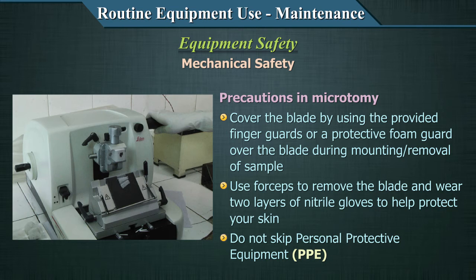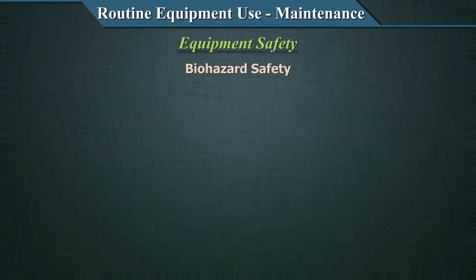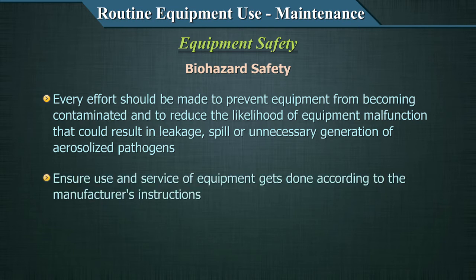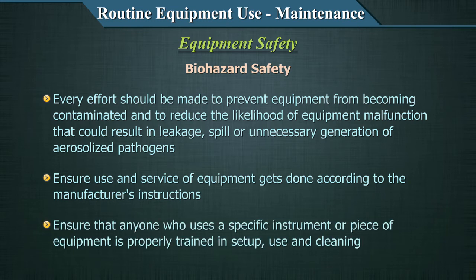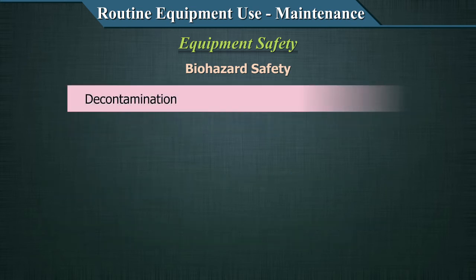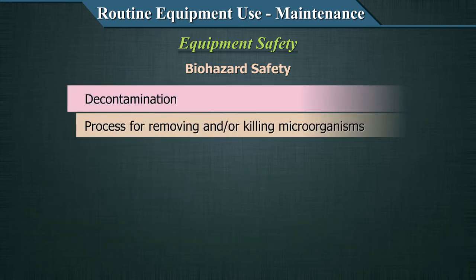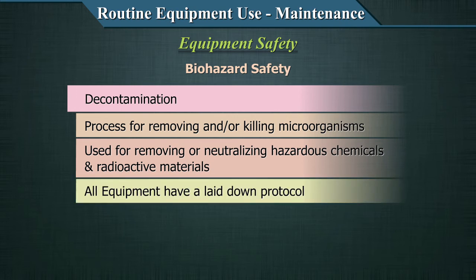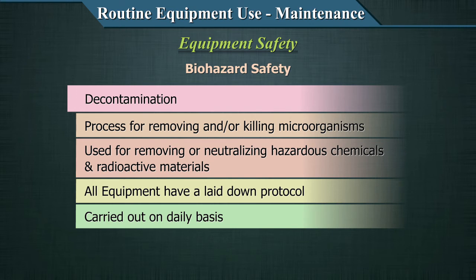Do not skip personal protective equipment while using microtomes — this will prevent lacerations and cuts. The third type of safety is biosafety. Every effort should be made to prevent equipment from becoming contaminated and to reduce equipment malfunction that could result in leakage, spill, or unnecessary generation of aerosolized pathogens. Ensure equipment service is done according to manufacturer's instructions and that anyone using equipment is properly trained in setting it up, using it, and cleaning it. Decontamination is a very important process for removing or killing microorganisms and neutralizing hazardous chemicals and radioactive materials. All equipment should have a laid-down protocol for decontamination, carried out daily after work and on an as-needed basis after spills.